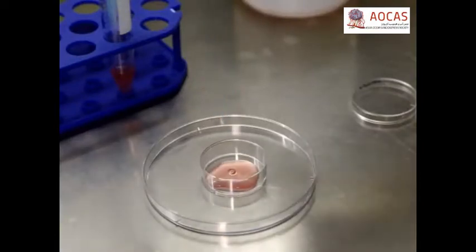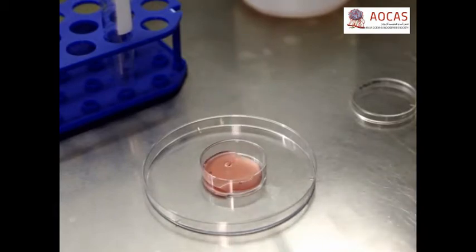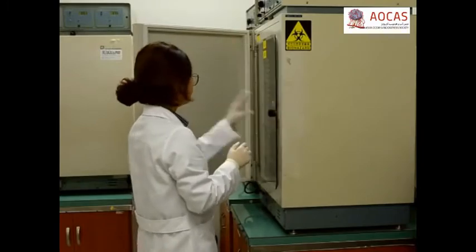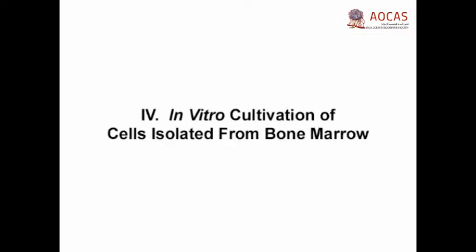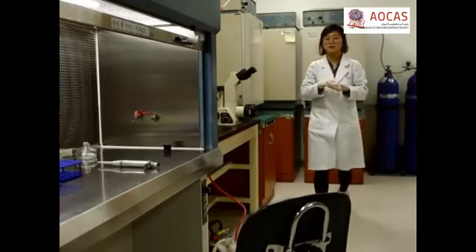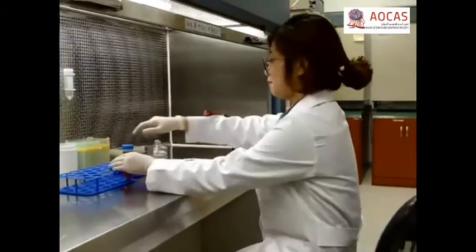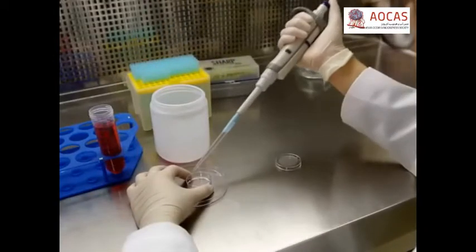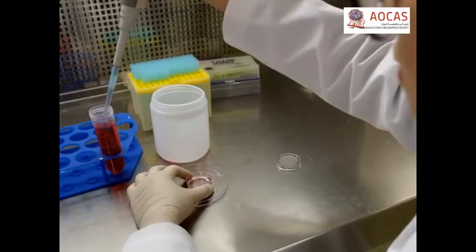Then, load the cells onto a 35-millimeter tissue culture dish and incubate them at 38.5 degrees Celsius in a humidified 5% carbon dioxide incubator. After 48 hours, aspirate the medium along with the unattached MNCs. Then, add back 2 milliliters of fresh ADMEM and continue the incubation, changing the medium every three days.